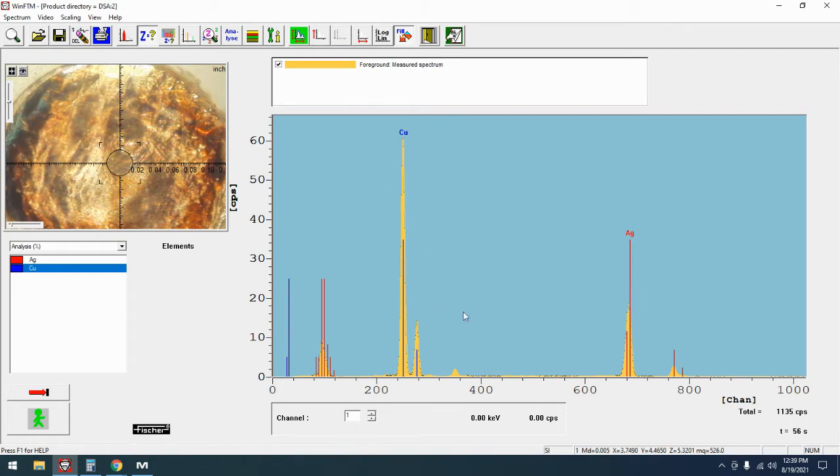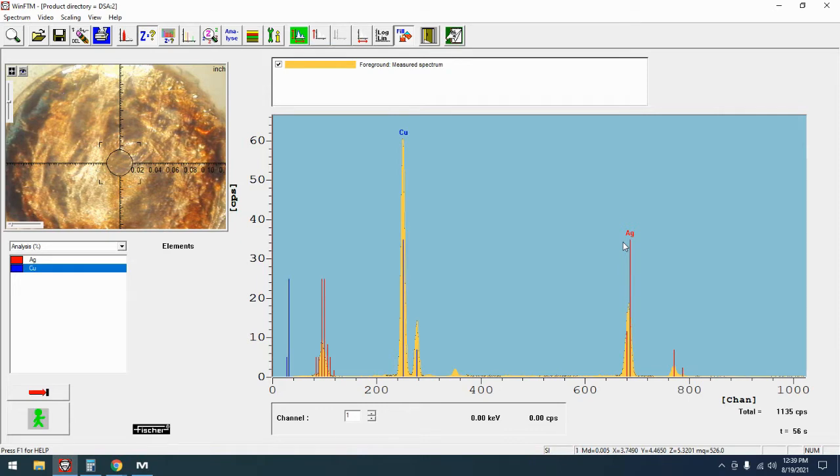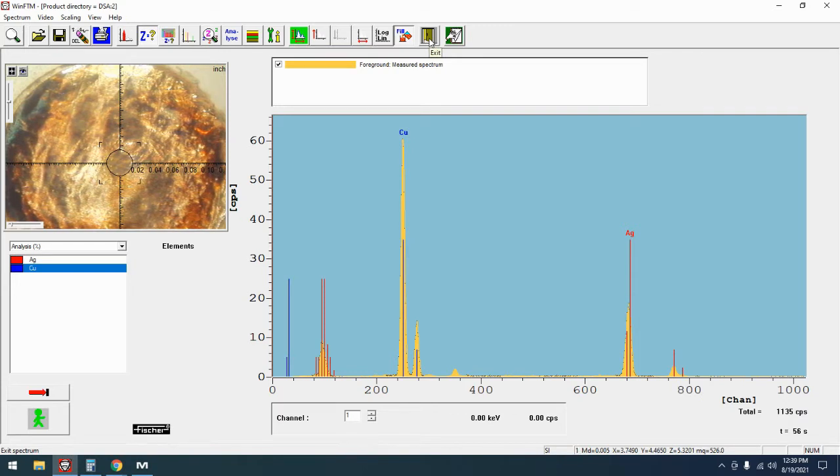So by knowing the relative intensities of both of these elements you can then shift your entire spectrum up or down as needed dependent upon the age of your tube, the age of your detector, things like that. This is going to give you a really good baseline for going in and then calibrating any of your other applications.